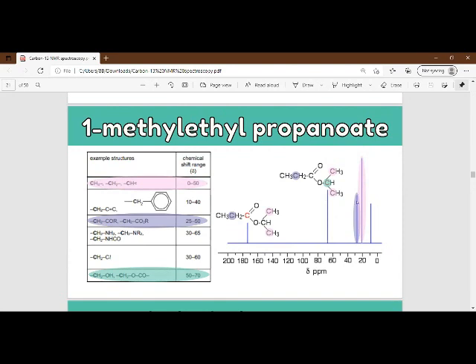So basically, it means this carbon, and the chemical shift is around 14. So it's actually this one. Then the tall peak at around 22, which is the pink one, is due to 2 methyl groups at the right hand end of the molecule, which is this carbon.